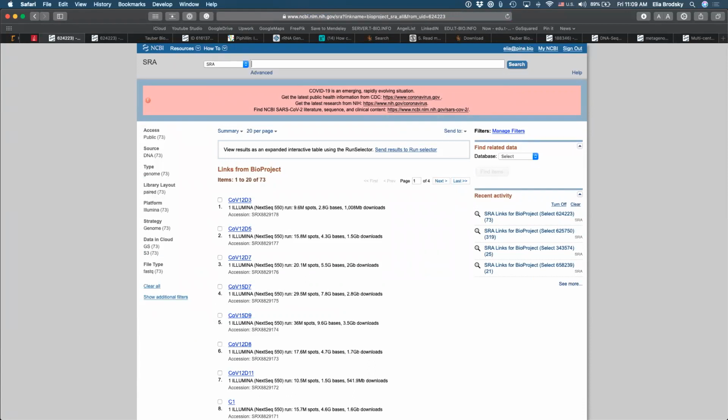Dr. Barker, yes, if the data is whole genome sequencing, you can take these samples and just do what we are doing, mapping them onto the 16S ribosomal RNA gene. If it is amplicon of a specific hypervariable region and it's paired end, there's a little bit more that you can do on the pre-processing side to make sure that your data is going to be denoised, so to say. We'll talk about that in our next lecture.